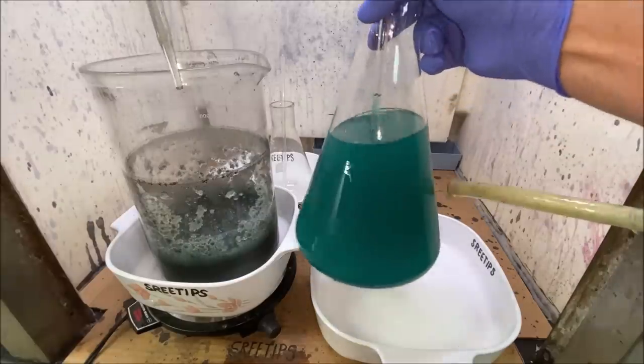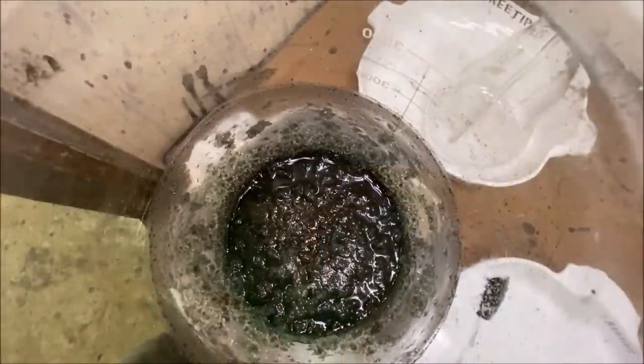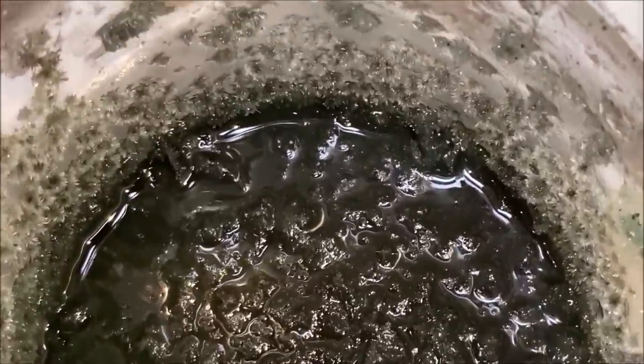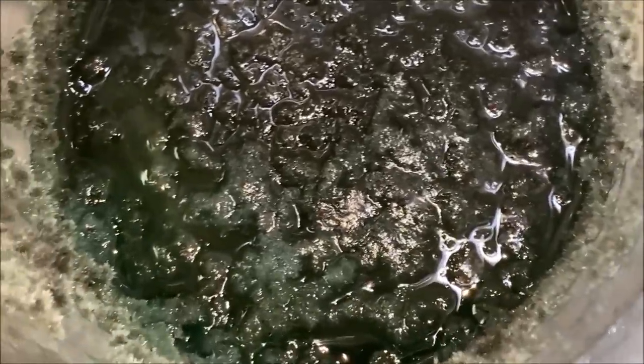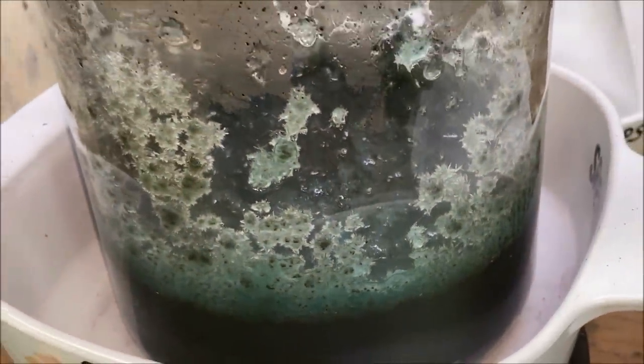Alright, we've got it drawn off here. Move this out of the way. Here's what's left down in the beaker. It looks like fun, doesn't it? It's a big mess. Got a lot of crystal growth on the inside of the beaker there. And we're going to have to add some water to this, stir it up, and let it settle.